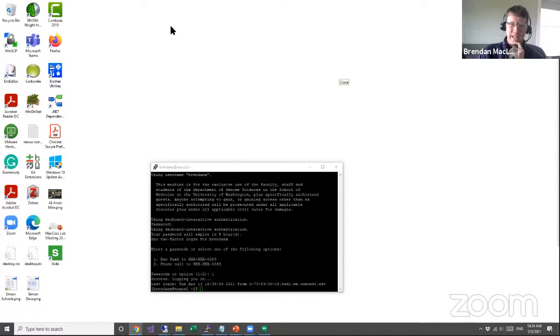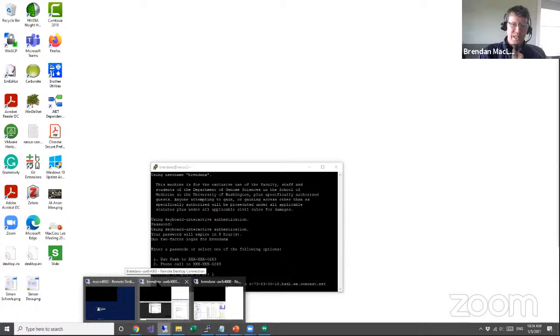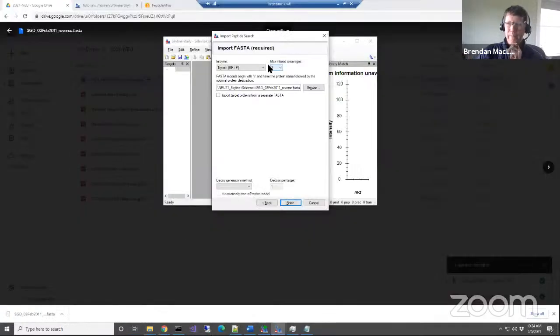We're going to continue, and anybody who is hopelessly stuck is going to have to do the extraction before running Skyline batch. Okay, so back to here. Oh, share the results of the poll. Yay, there you all are. So now we can just click finish.